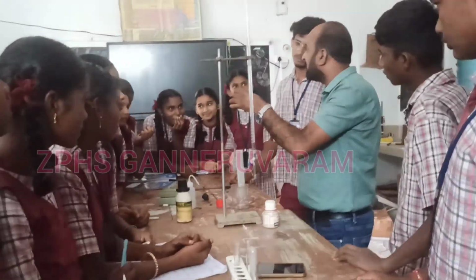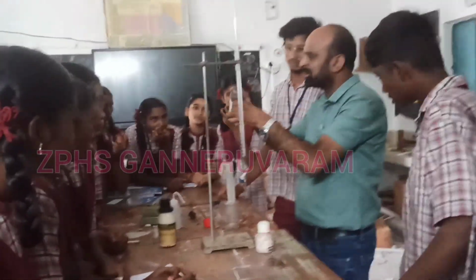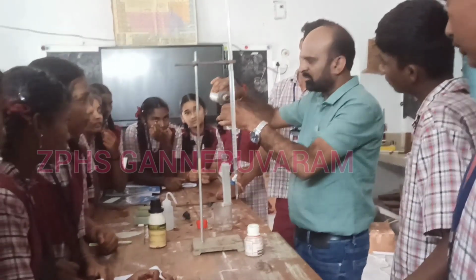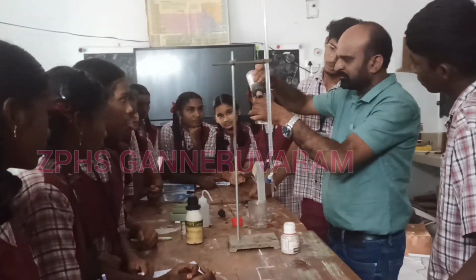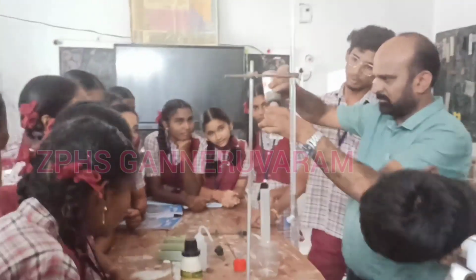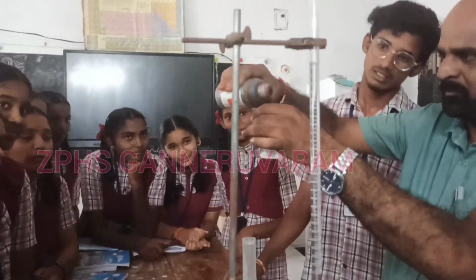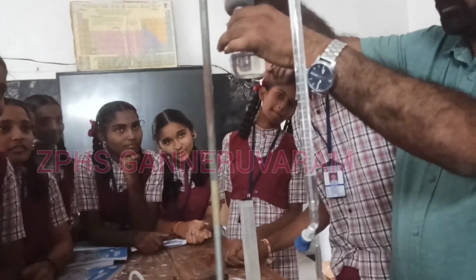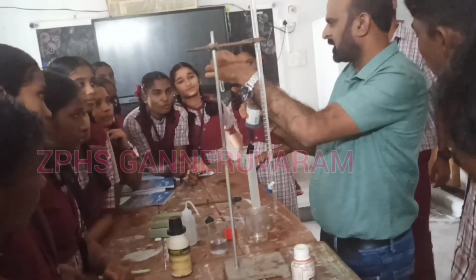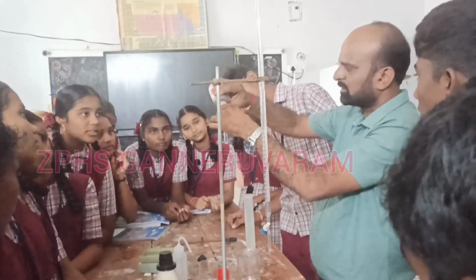What color will be obtained? Red color changes to blue color. Whether it changes or not, we will see. Now, 5 ml of sodium hydroxide solution, I am adding red litmus.